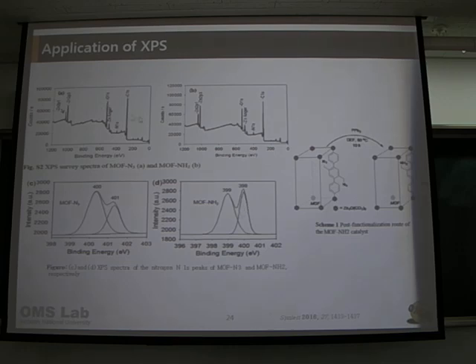Actually, the upper peak, the survey data, shows nitrogen, both of the survey data contain nitrogen, but this nitrogen peak is different. If we draw, I know.